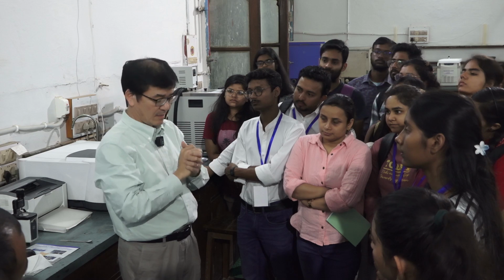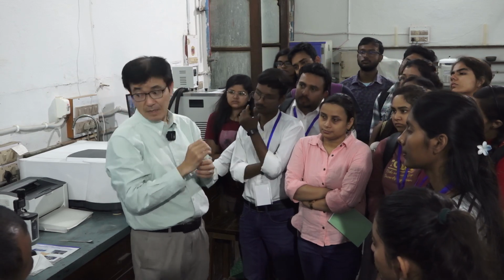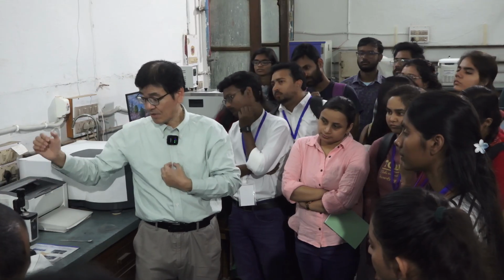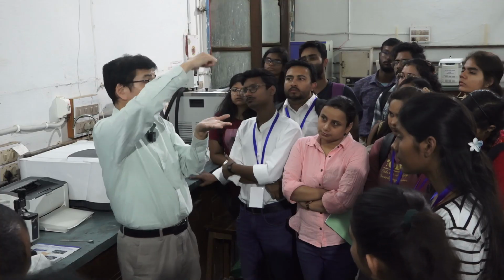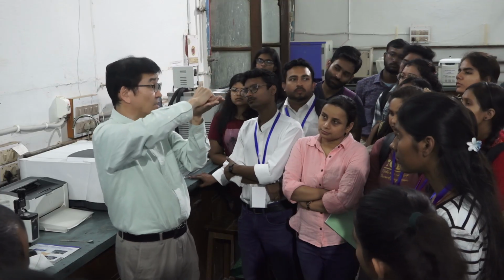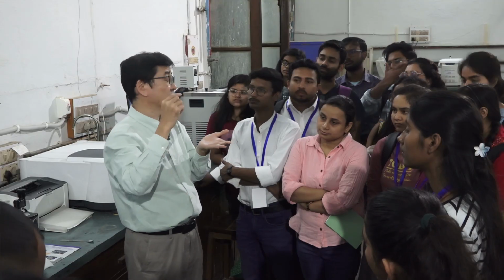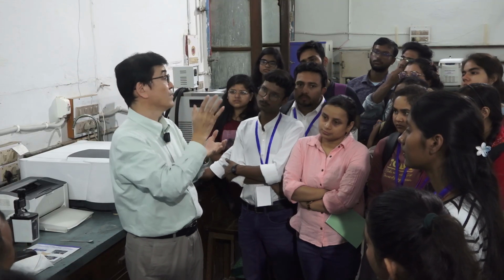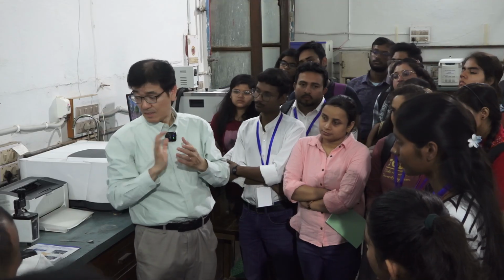This is an explanation about the instrument. Another advantage is that the sample amount is quite small. Only one drop to touch the germanium prism is sufficient. And the experiment finishes immediately because FTIR is a very fast measurement.